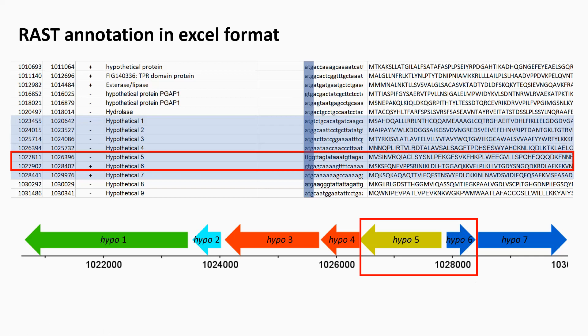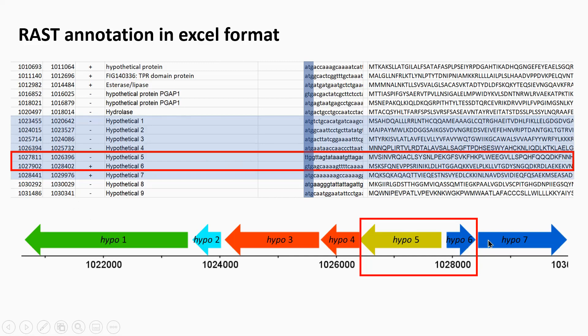The reason is because of the start codons, especially hypothetical gene five. You can see here it starts with TTG. Hypothetical gene six starts with GTG, and there's quite a short intergenic region between the two genes.